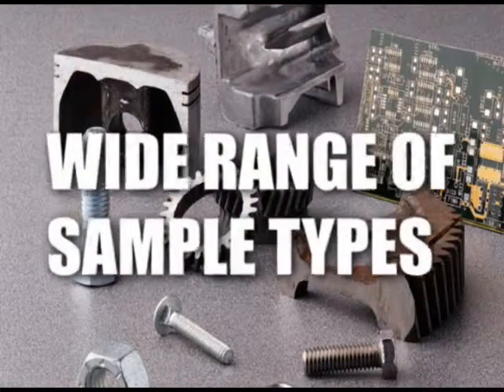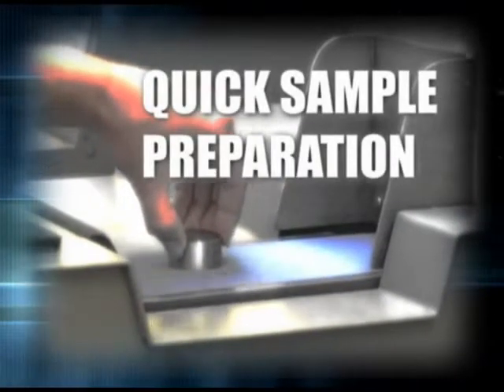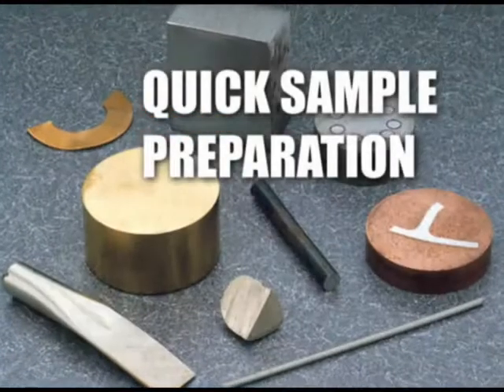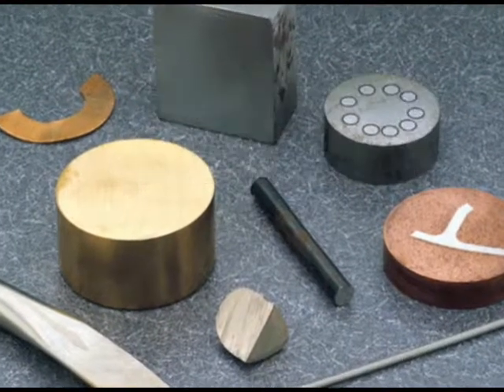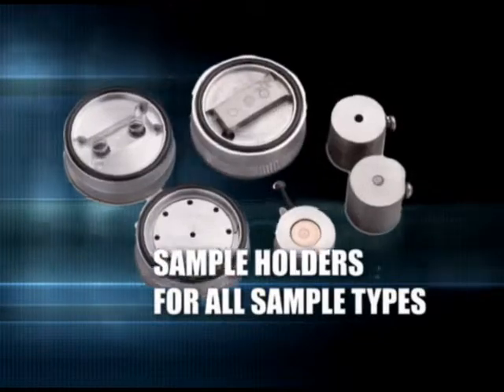Sample preparation for analysis is quick and simple. It involves only a simple grinding step to prepare the surface for analysis. Various sample holders are available for non-uniform shaped items.